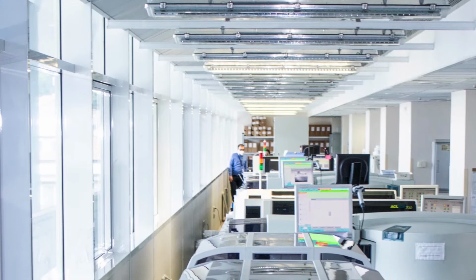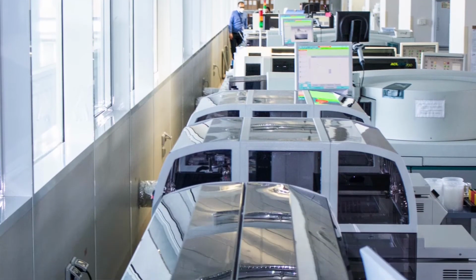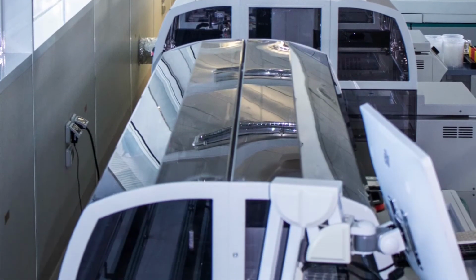Buying an independent track forced us to study the various implications of our project in depth. We chose to build it the way we wanted it to be. A turnkey system, on the other hand, you have to take as it is. You don't have a chance to get a lot of customization.